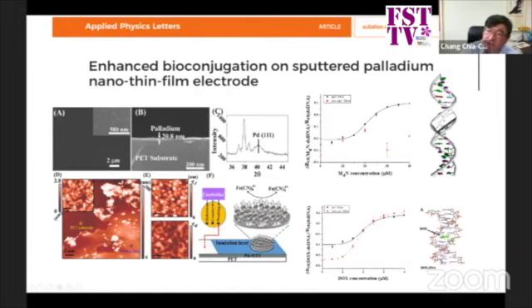We can find that some drugs interact with a specific DNA sequence, such as some drugs recognizing the SP1 sequence but not non-SP1 sequences. So it can be detected.